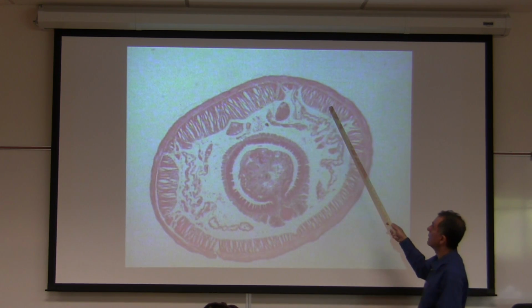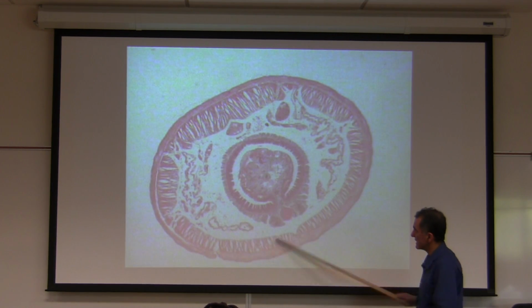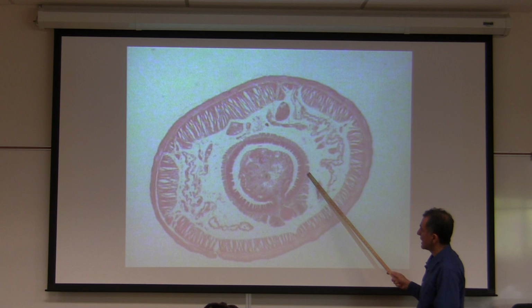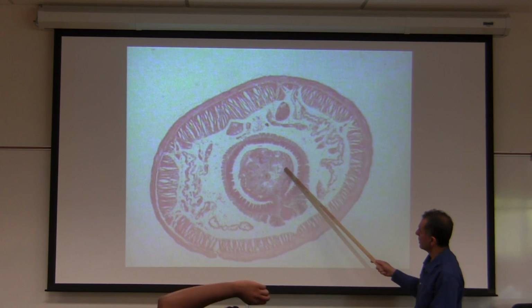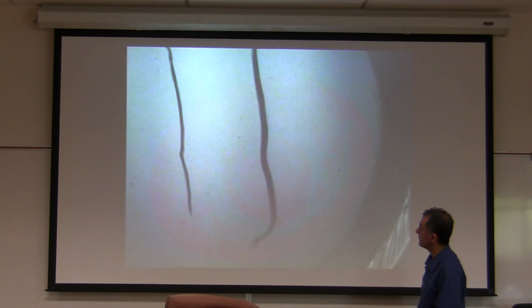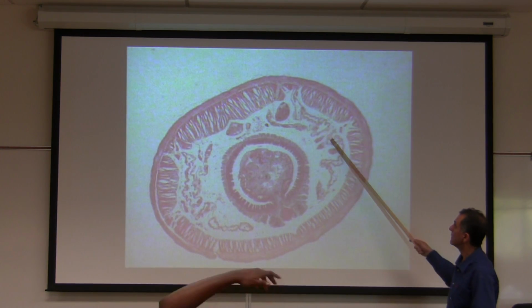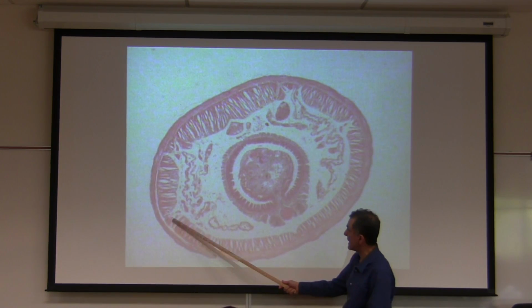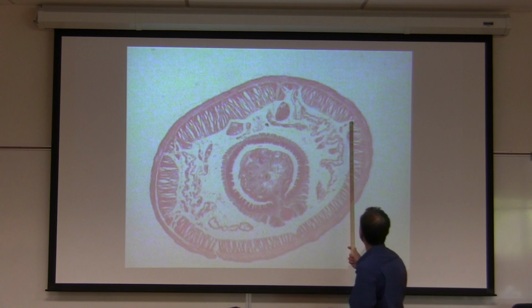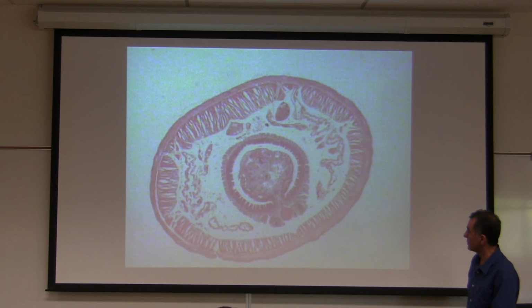Kidney, nephridia, longitudinal muscles, circular muscles, epidermis, intestine, chloragogen cells, epithelial cells of intestine, typhlosole, coelom. Professor? Yes. What was the kidney on that? Right here. Oh, nephridia. Yes, nephridia. And sometimes on some of these you have the remnants of setae, but some of the slides show them, some of them do not.